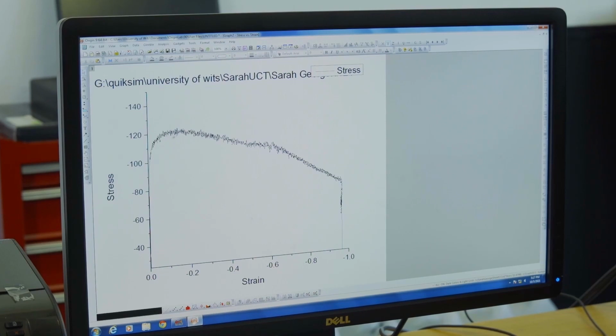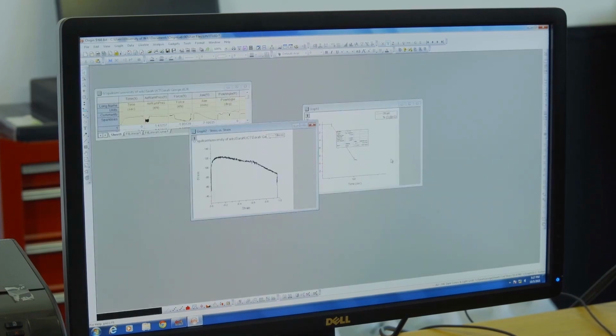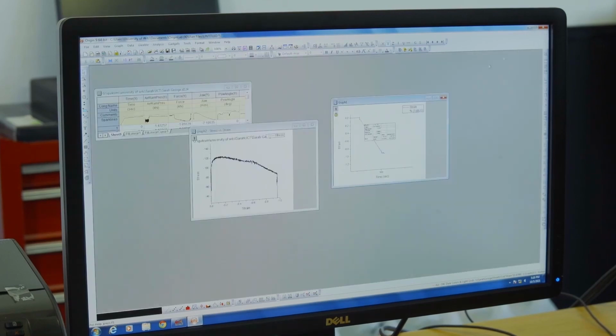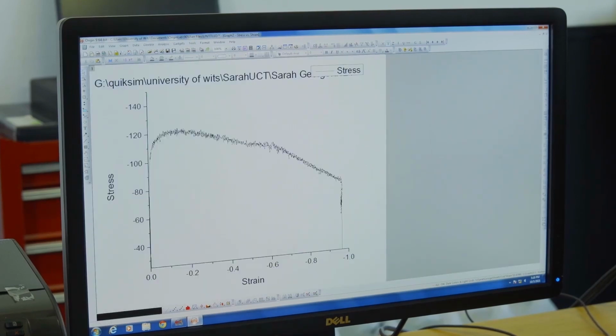And yeah, so that comes to the end of the whole analysis. I've been able to show you how to determine the strain rate, by plotting strain versus time, and you calculate the slope of this deformation region, that is strain per unit time, and the slope tells you the strain rate. And again, this is the stress strain curve indicating the flow stress.